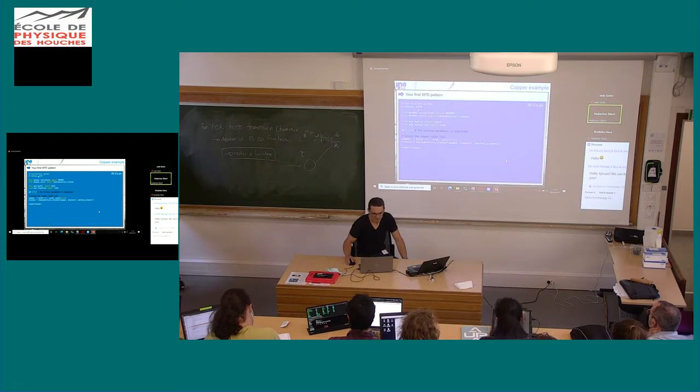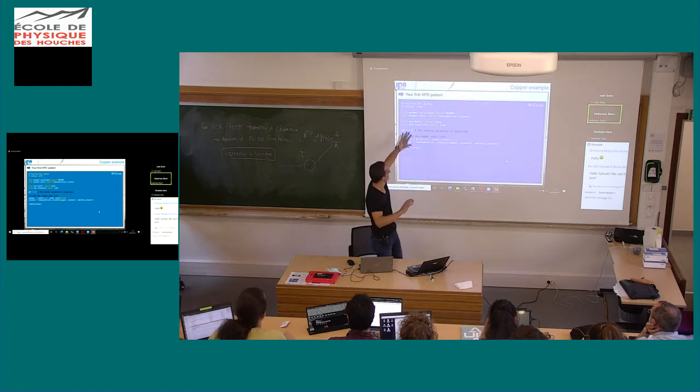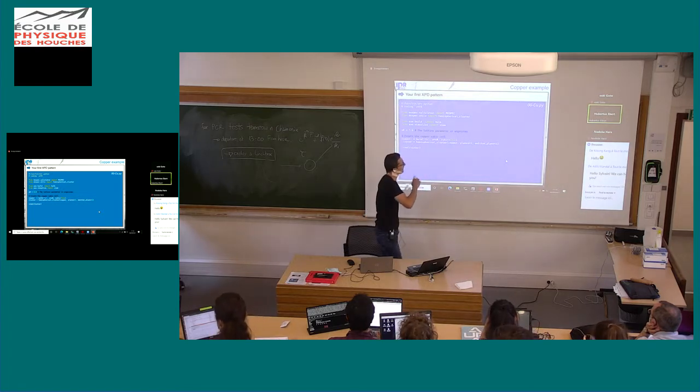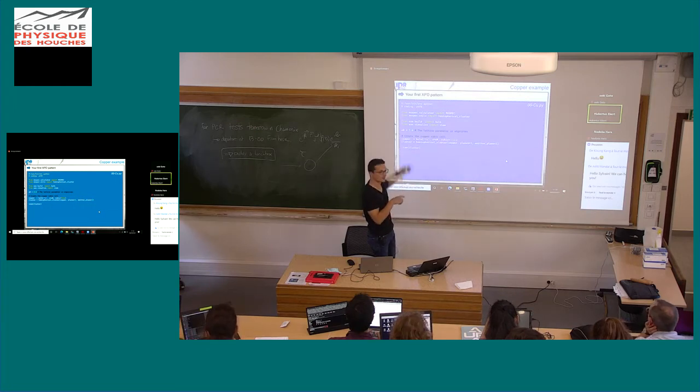So here is a really basic example for creating a small cluster of copper and plotting the polar scan for the photoelectron diffraction signal. In this first part, I do not calculate anything. I will just walk through the script, and I would suggest that you open a text editor, write this down by hand, understand the lines, and do this with me, okay?